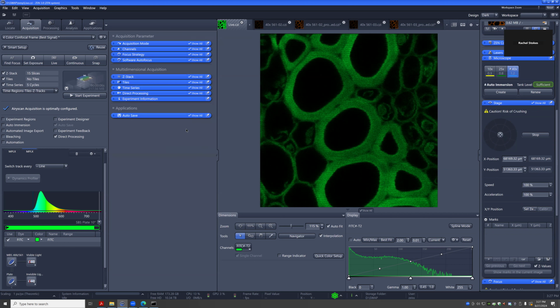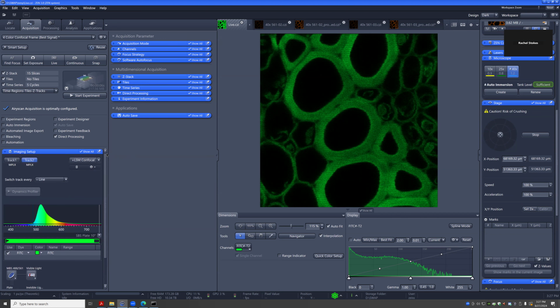Minimize this one here. Yeah, I think as a basic start, that's a good point. Ben, I know everyone's brains are probably getting a little fried.